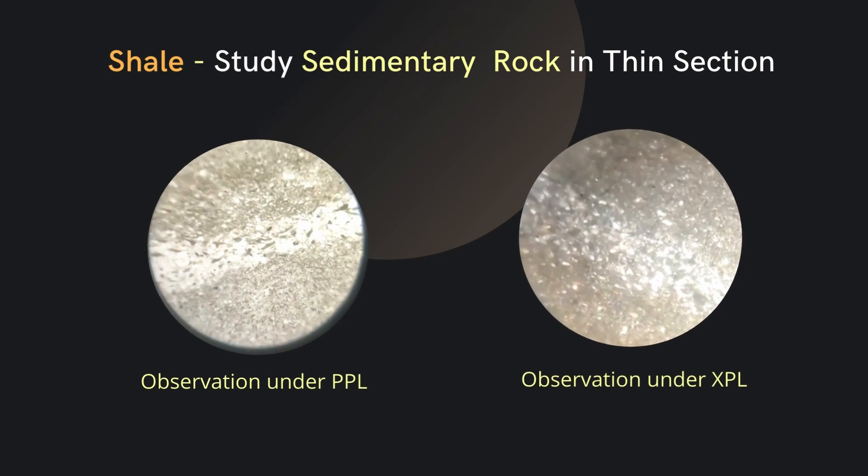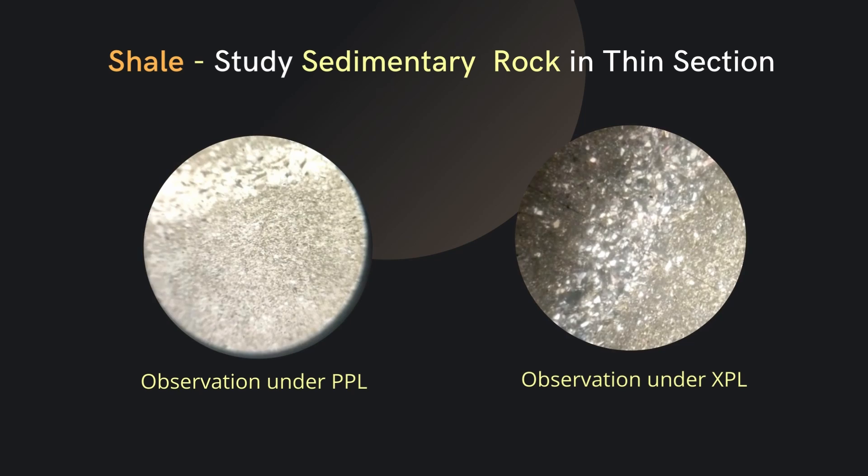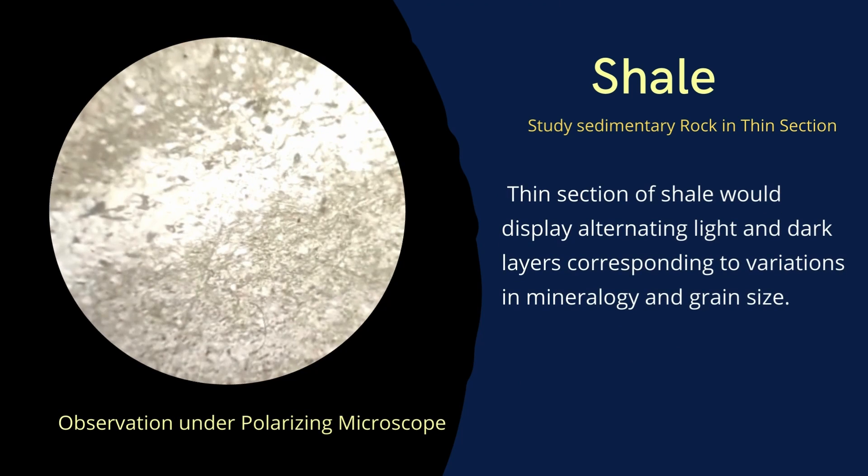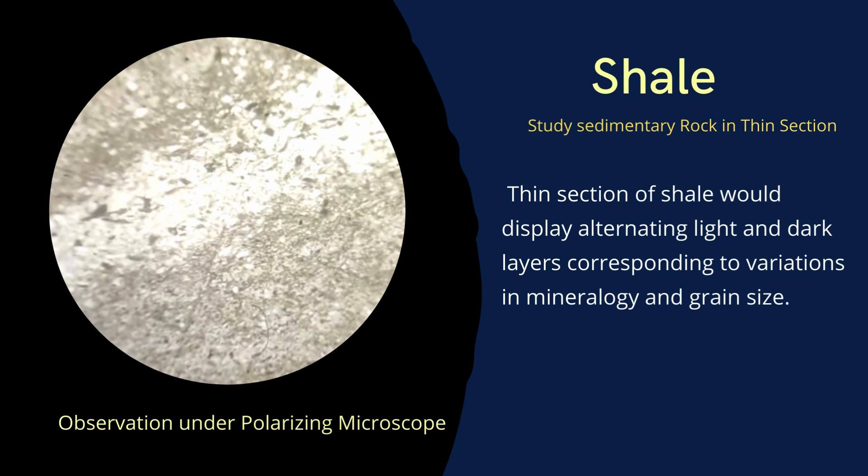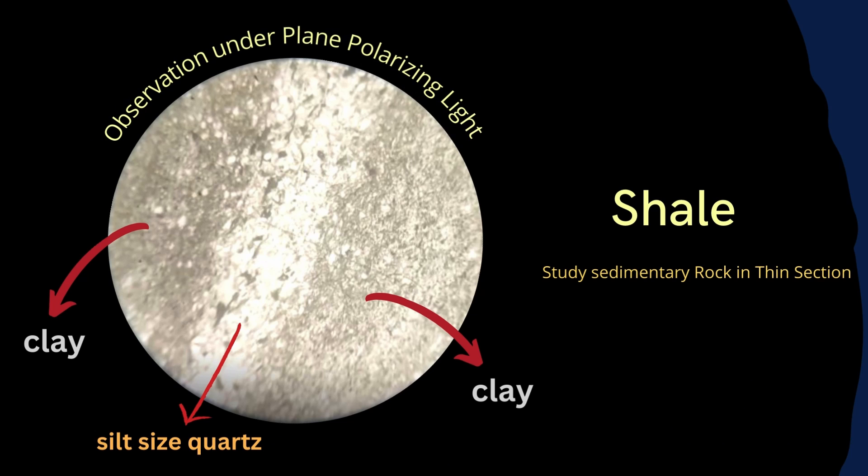Let's observe the thin section of shale under the microscope. Here you can see both in PPL and XPL. Thin section of shale would display alternating light and dark layers corresponding to the variation in mineralogy and grain size.